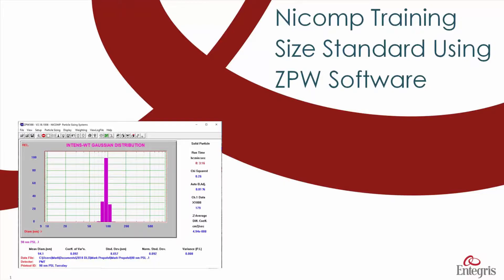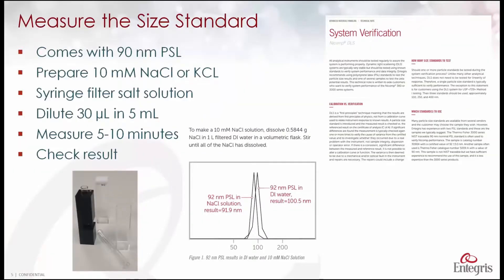This is NICOMP training on how to measure a size standard using the ZPW software platform. First we'll prepare a 10 millimolar sodium chloride or potassium chloride solution.